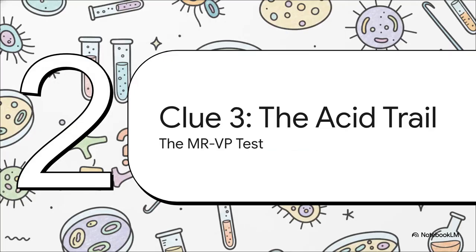Okay, on to our third and final clue. And for this one, we're getting really specific. See, it's not enough to know that acid was produced. Now we need to look at the exact chemical trail it left behind. And that is the job of the methyl red and Voges-Proskauer test, or as everyone calls it, the MRVP test.